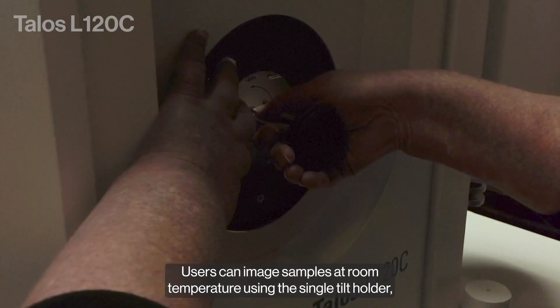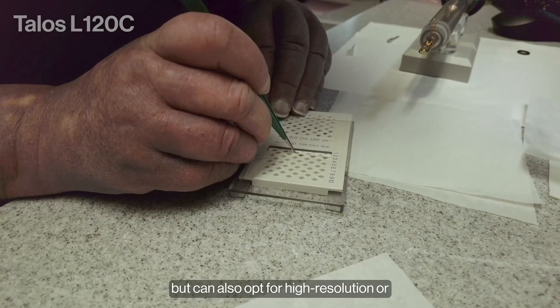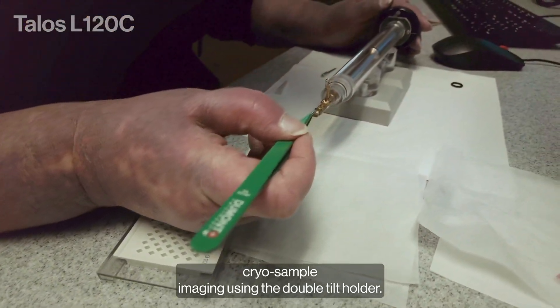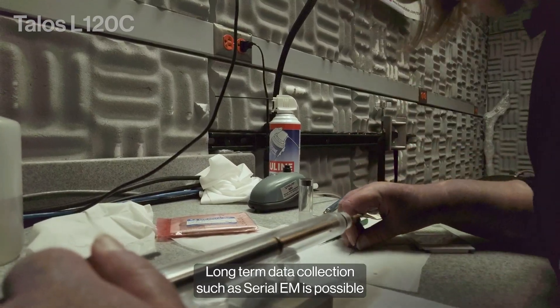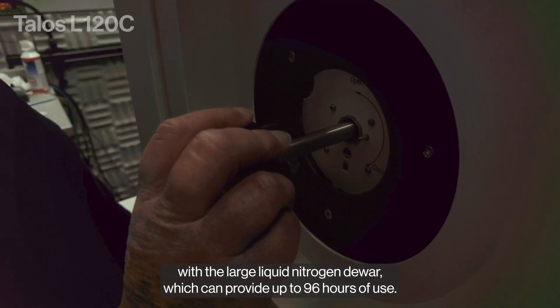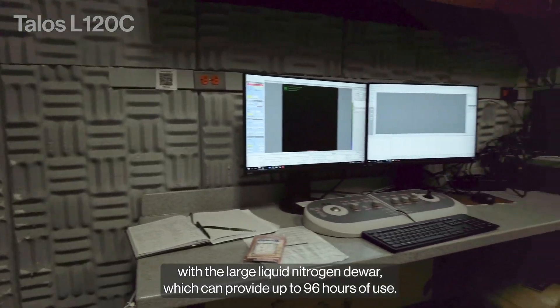Users can image samples at room temperature using the single tilt holder, but can also opt for high-resolution or cryo-sample imaging using the double tilt holder. Long-term data collection, such as Serial-EM, is possible with the Large Liquid Nitrogen DEWAR, which can provide up to 96 hours of use.